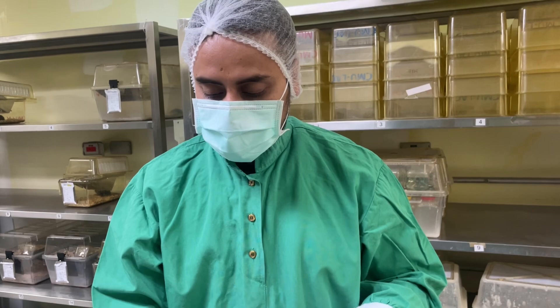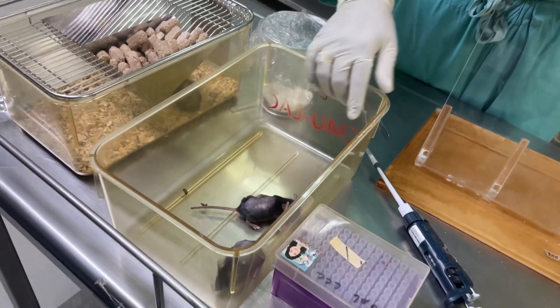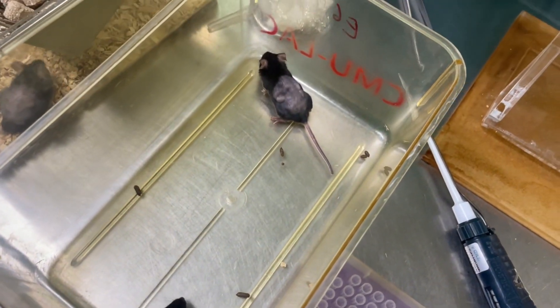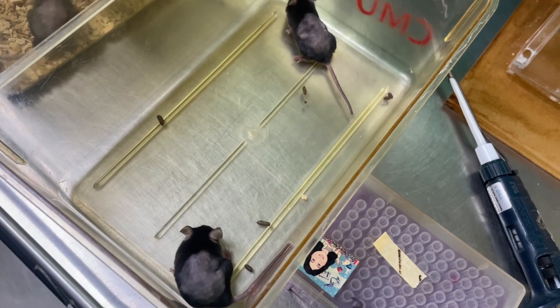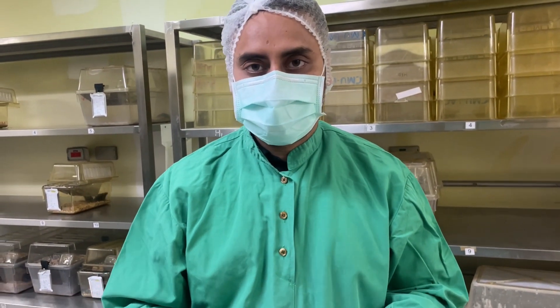Keep observing your mouse for one or two minutes. Now the mouse is starting to move, which means the mouse is fine. That's how we administer the intratracheal gavage. Thank you.